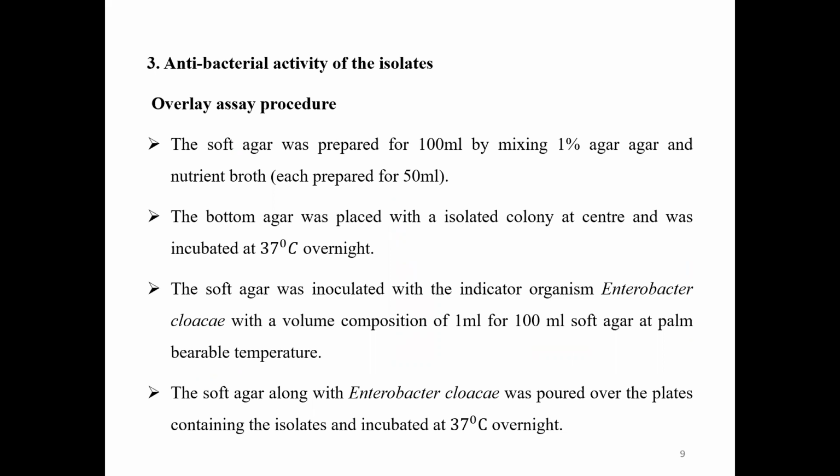Then the soft agar was inoculated with Enterobacter cloacae, which is the indicator organism. The soft agar was poured over the bottom agar. Then we incubated at 37 degrees Celsius.